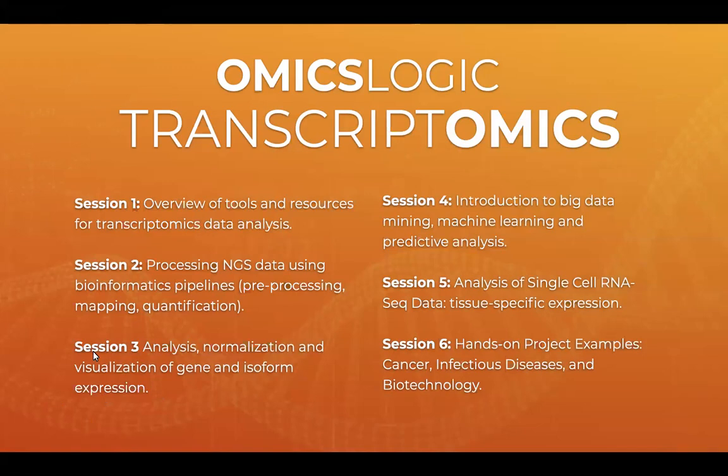So what are some library preparation steps? What are some of the initial steps of the analysis? Basically, how do we start processing the data so that it is structured so we can do the analysis? And what does it essentially represent? So what are we quantifying?